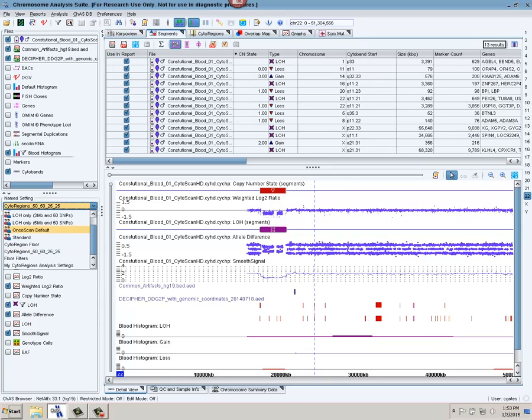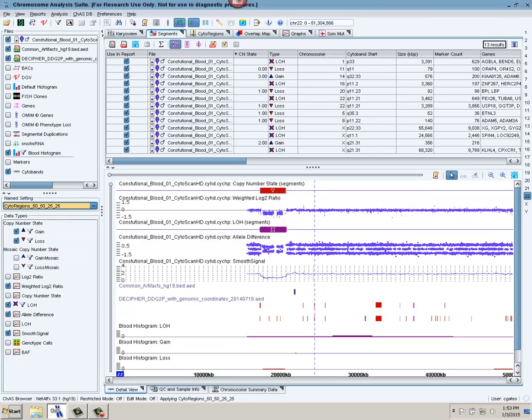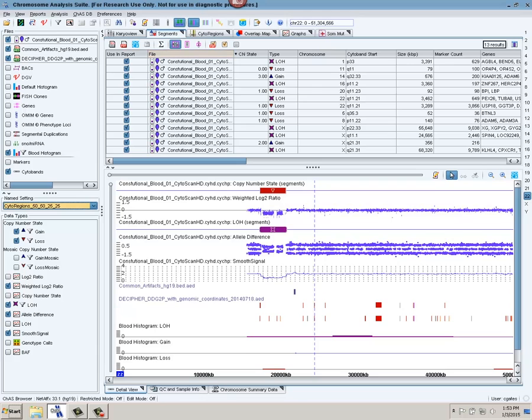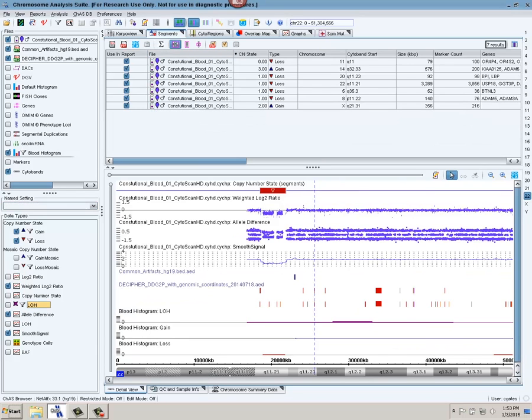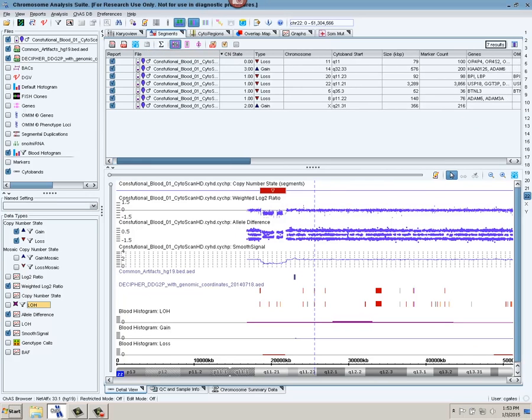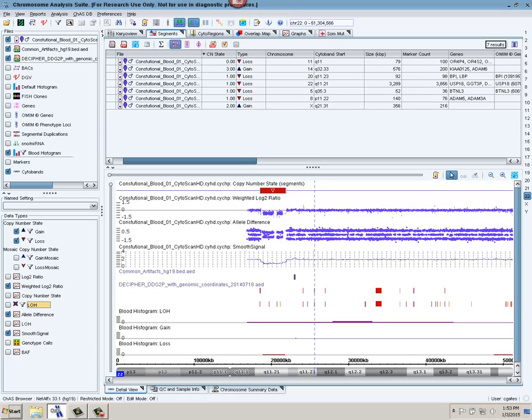I'm going to go to the segments table. I'm going to choose my named setting of interest. In this case, I'm going to choose cytoregions. And what this means is every 50 markers and 50 KB for gains in order for a segment to be drawn, and 25 markers and 25 KB for a loss segment to be drawn. So as you can see right here, we have 13 segments. I'm going to uncheck the LOH. For right now, we're going to concentrate on our copy number segments first.